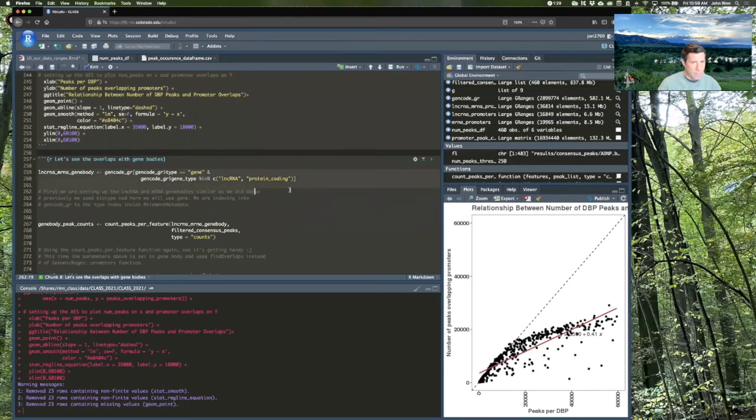Okay, so now let's look at this by the two different types, or let's look at the gene bodies. Right now we've done the promoters with find overlaps, which all could have been done with the findOverlaps and promoters functions in GRanges. We just made our own functions to add our own parameters. For lncRNA and mRNA gene bodies, we can also overlap not just the promoter, but the entire gene body. And we saw before that with type gene, we only get things that are genes, not pseudogenes or other types of things. That gives us just one entry for a given gene name.